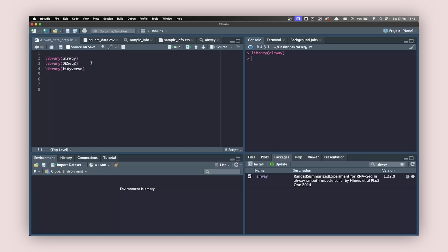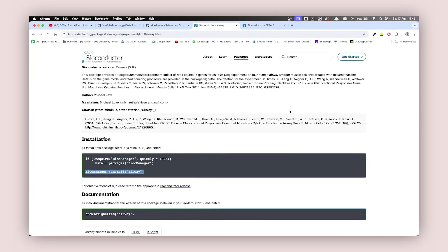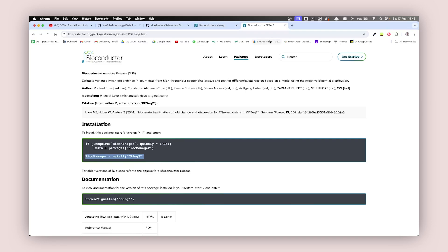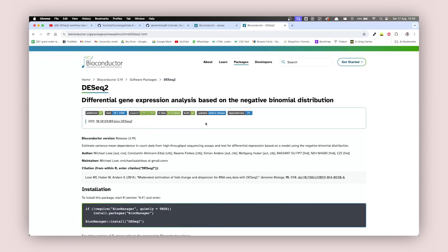Since we're doing RNA-seq analysis, we're going to use another package from the Bioconductor packages — this is called DESeq2. You can go to Google and type in DESeq2, and the first link will take you to its page.